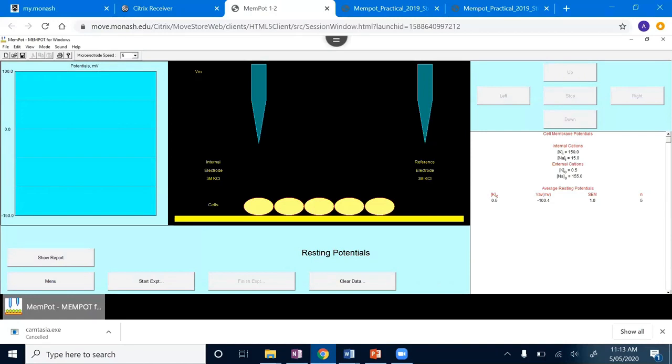So imagine in this setup, I've got a micropipette. Within this micropipette, I'll either have different concentrations of potassium ions or sodium ions for part 2. I'm introducing those to the surface of the membrane cell. They're not actually passing through, not piercing it, even though you might see me pierce the cell. It's laying there embedded on the cell surface, the membrane surface of those cells.